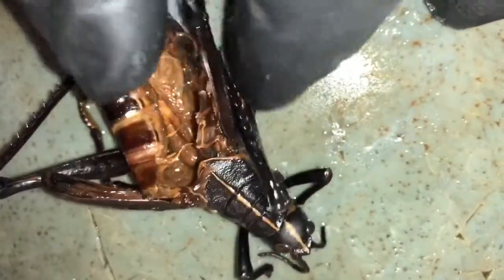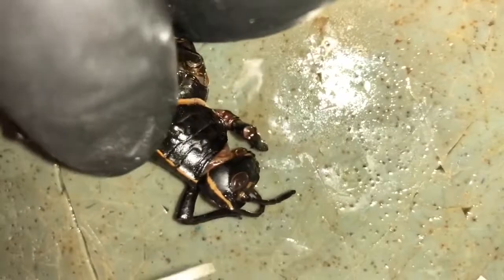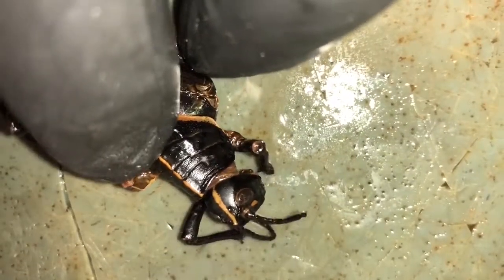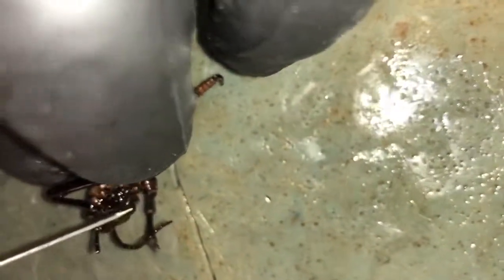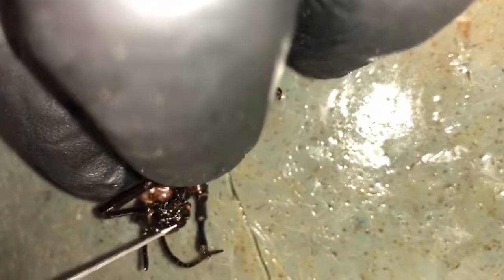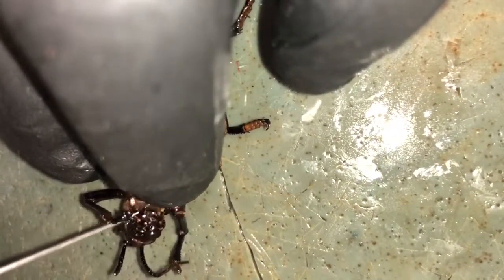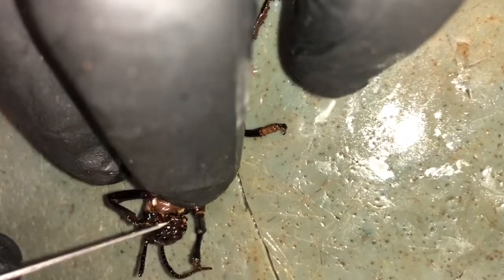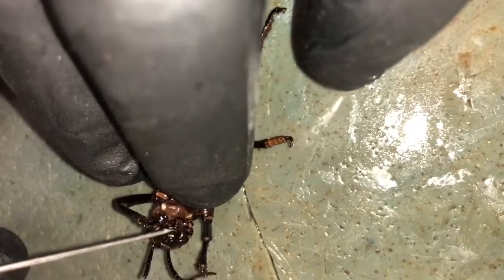Right there. Where's the compound eye? Right here. Antenna? Right here. Can you show me the labrum? Right here. Labrum. Yep. Can you show me the maxilla? Those are the ones. Okay, labium, please. Labium should be right here.